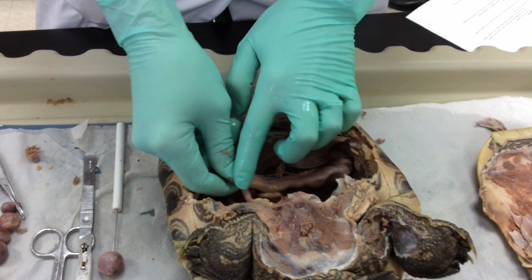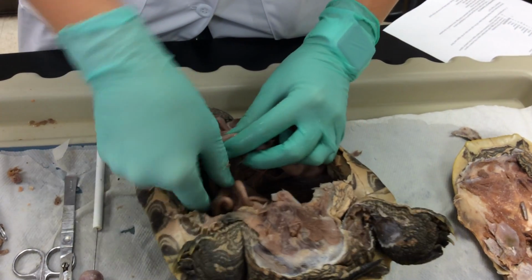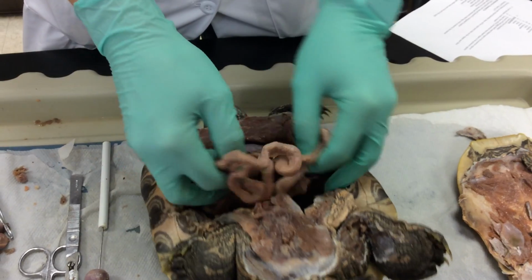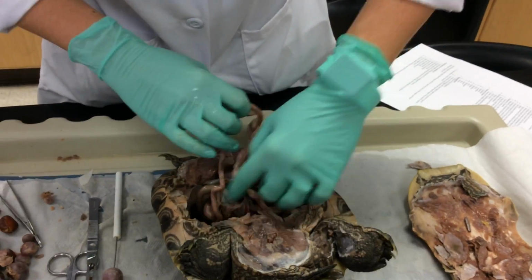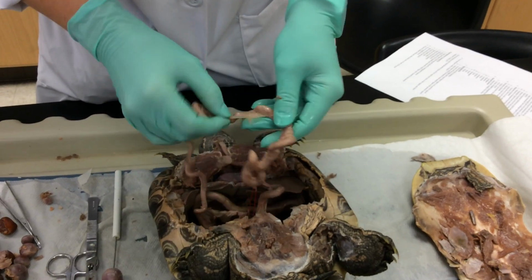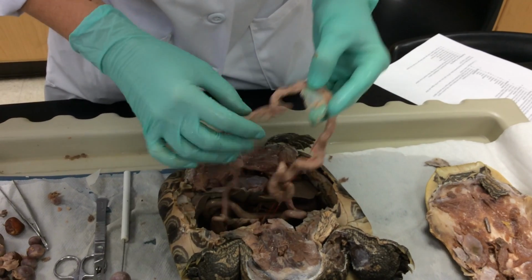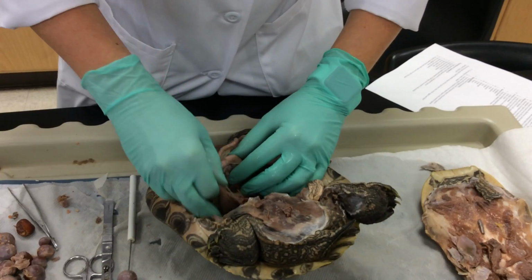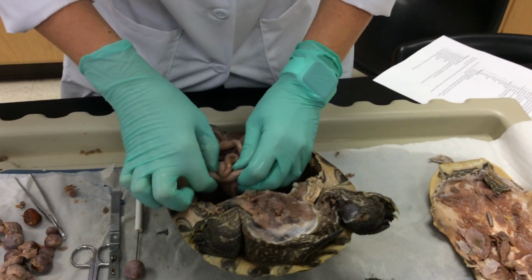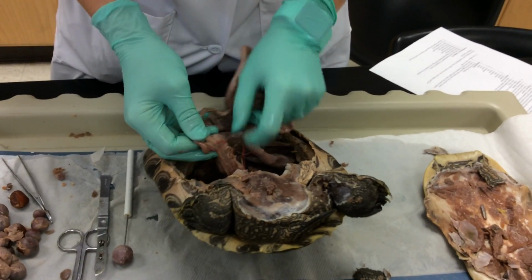So again, this is the small intestines, this is the pancreas, then the small intestines, or the duodenum, goes into the full part of the small intestines, which is all this stuff right here. Now, all of this stuff is connected together by this tissue right here, and this is mesentery. It's connective tissue that keeps the small intestines together. The small intestines continue on and on, and you get to a point at which it changes.